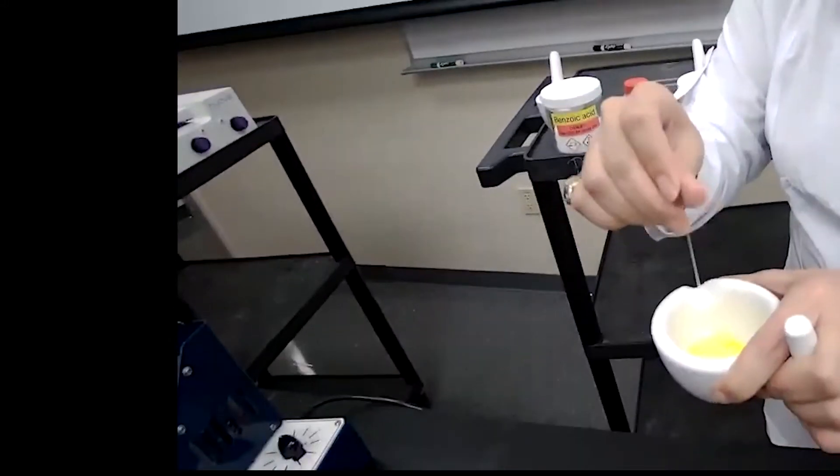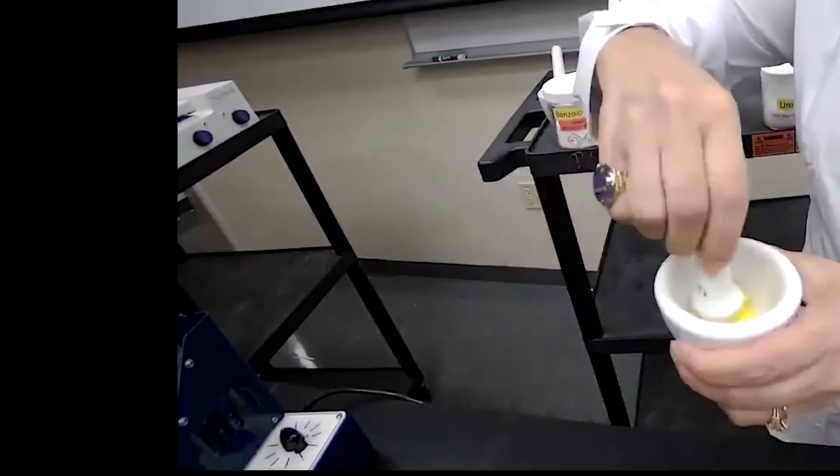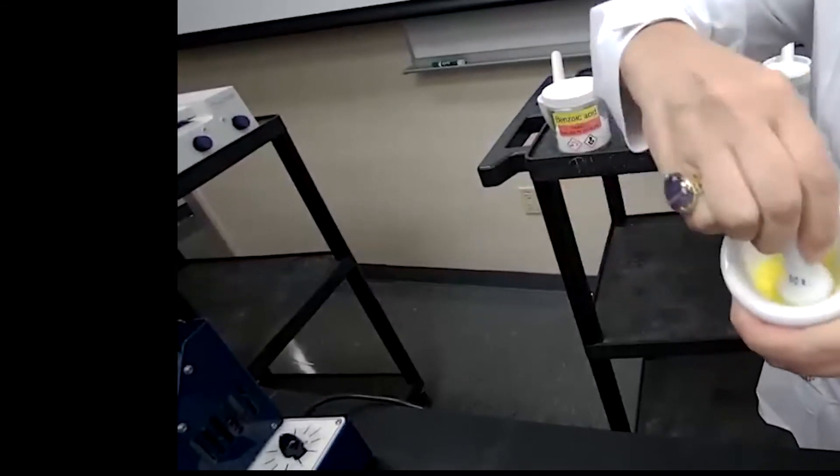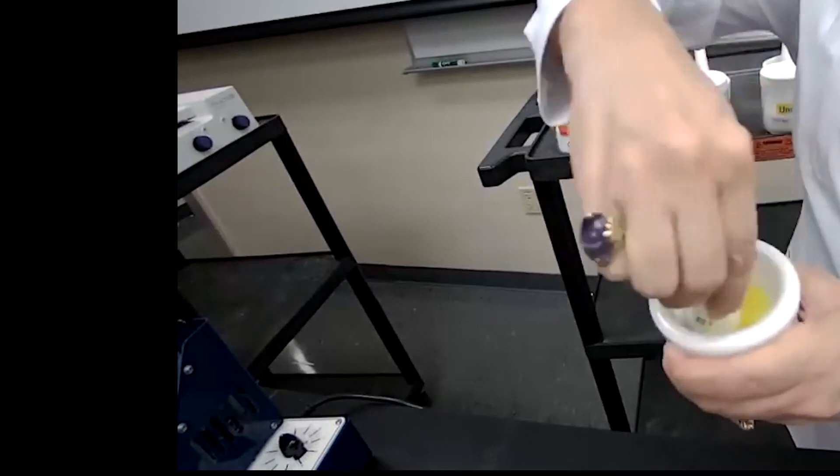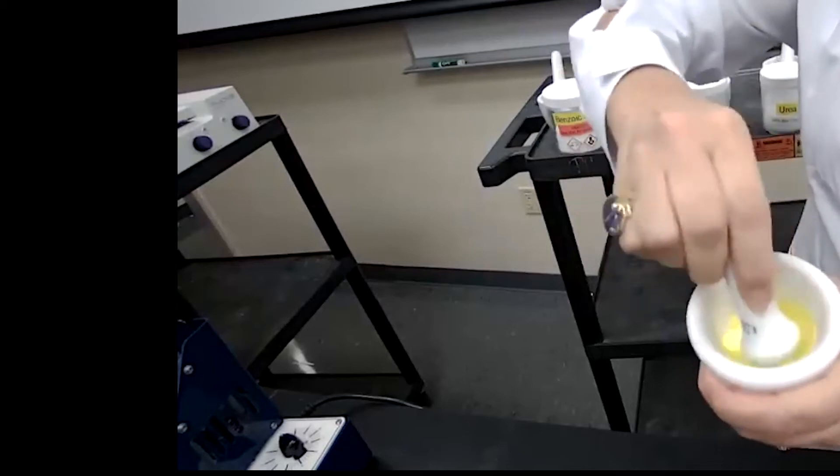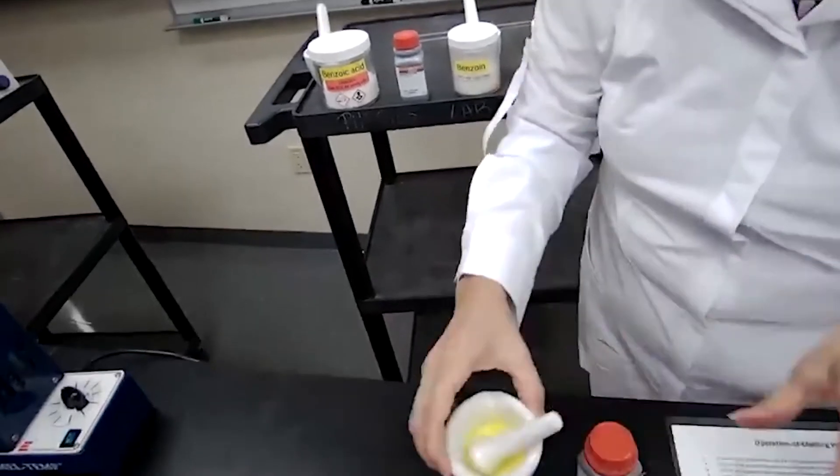So first step for us in the sample prep is to grind the sample to get into like finely powdered sample, which feeding the capillary tube is going to be then much easier. So we are going to grind the sample. The sample is now finely powdered.